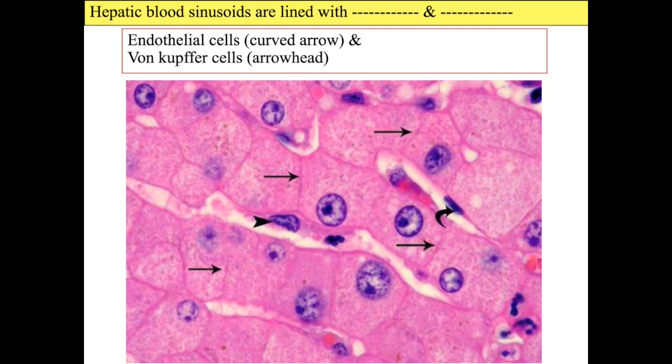If you are asked about the stain, it should be stained by a vital stain. Why vital? Because this stain is injected inside the living organism, and after it is phagocytosed by this cell, the organism is killed and dissected, and the section is prepared to see the pigment inside these cells only. All the phagocytic cells are stained by vital stain, like trypan blue or India ink.